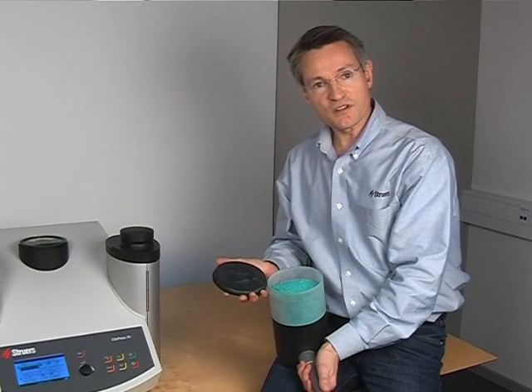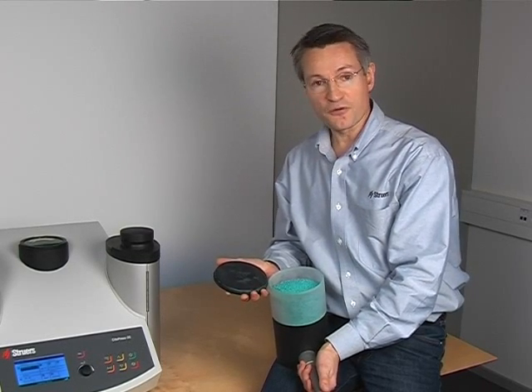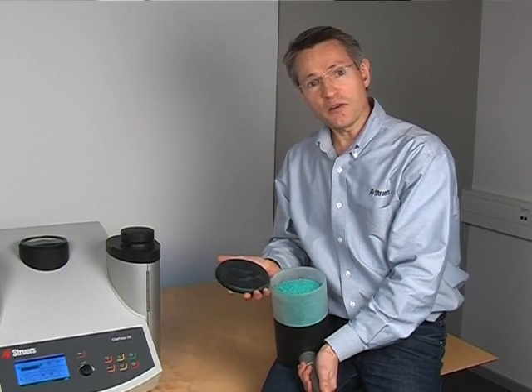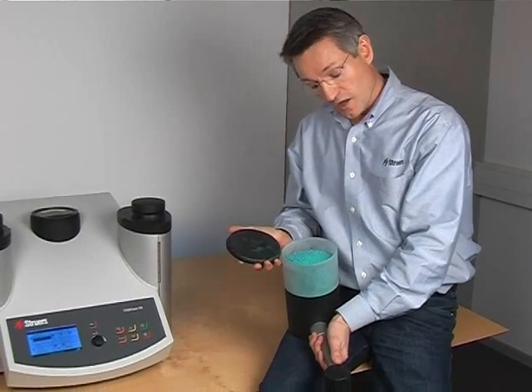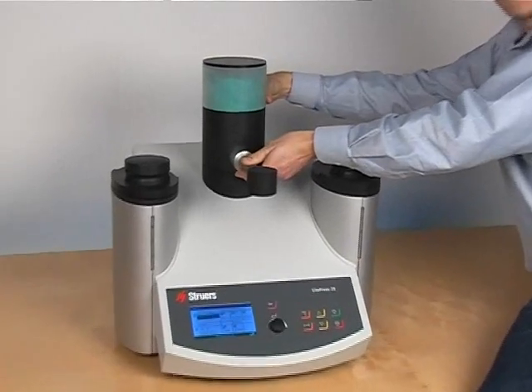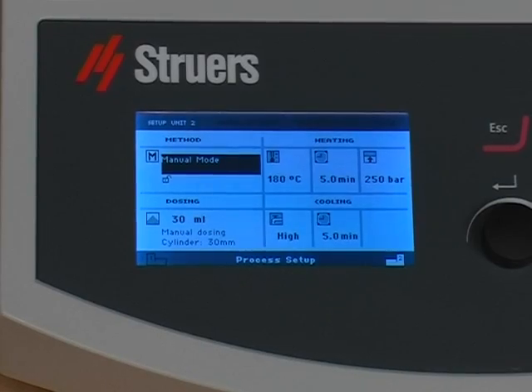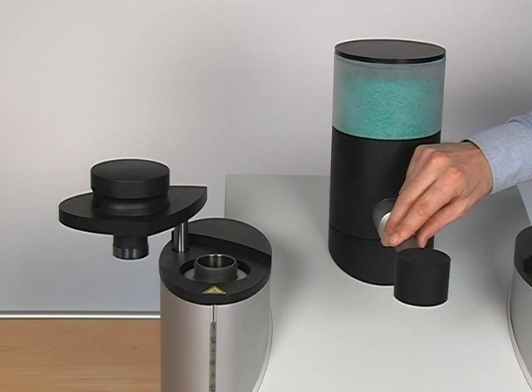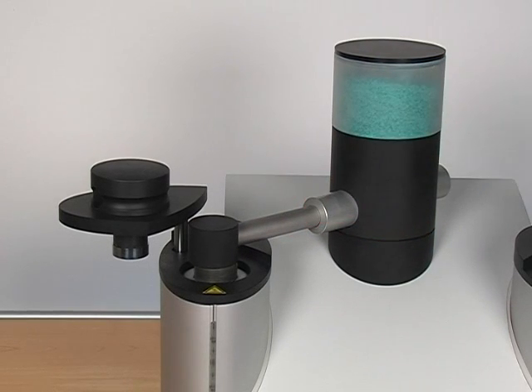An important part of the mounting process has gone largely unnoticed until now: dosing. How would you like getting the right amount of resin into the specimen by simply pressing a key? CITODOSER makes this possible. A built-in chip in the dosing unit allows the press to recognize the dosing unit. In turn, the press automatically retrieves the method last used with that dosing unit.